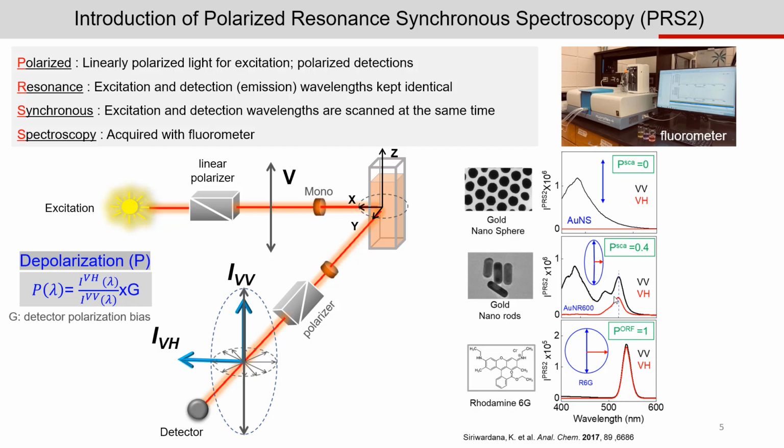And if the direction of the polarized light is totally randomized by the fluorescence process, the intensity in the VH spectrum will be equal to that in VV. In addition, if we know how much light is depolarized, we can deduce the globally distributed photons and quantify the cross-sections, rather than just provide intensity measurements along one direction.